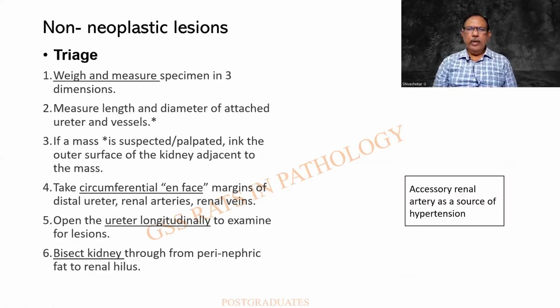There are certain important things that we will have to do, whether it is going to be a neoplastic or a non-neoplastic lesion. So let us assume it is non-neoplastic. There are a few triage steps that you will have to go through. One is weigh and measure. This we usually miss. And when I say measurement, it has to be a three-dimensional measure. And weight is indispensable.